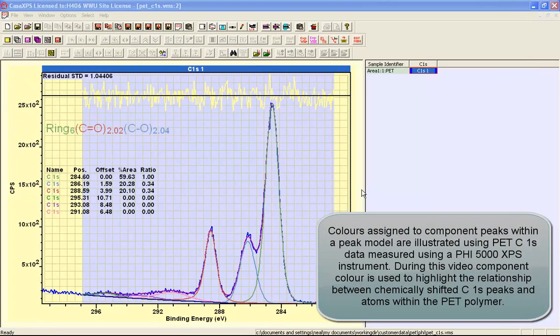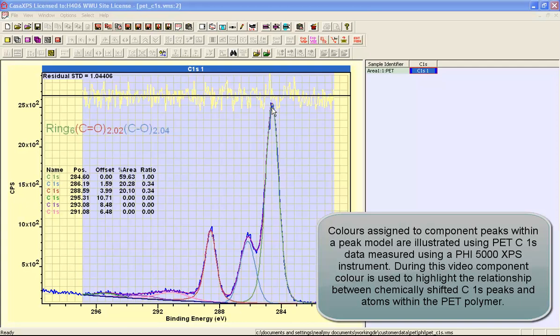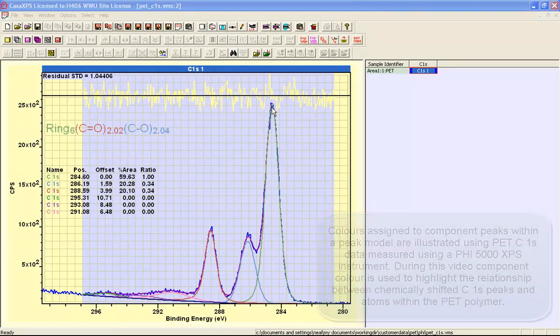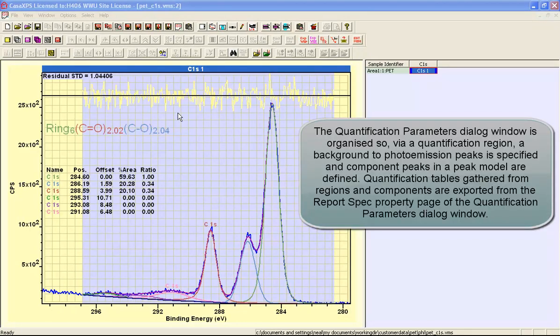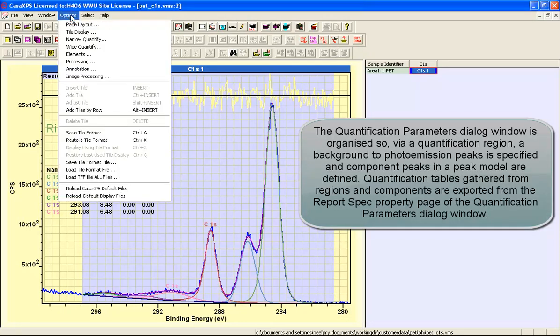In this video we're going to look at how to display components within a peak model and how to make use of different colors for these components to best represent the chemical state information within data. A peak model is defined using the quantification parameters dialog window.